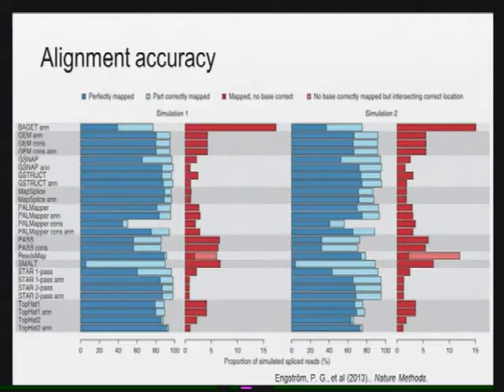Yeah, and I only say that because I've done very limited testing, to make sure STAR was working as well as TopHat before I moved to it, because it is way faster. Right, exactly. Has larger memory requirements. But I think it's 20% fewer reads with junctions for STAR. I haven't done a great assessment of that, but that's what I've seen in a few tests that I've done.